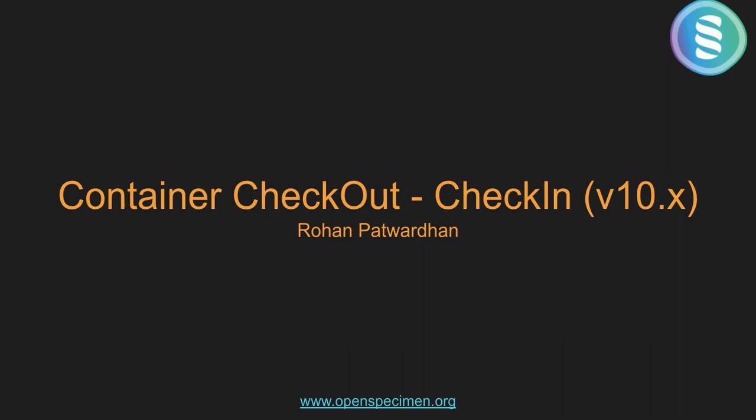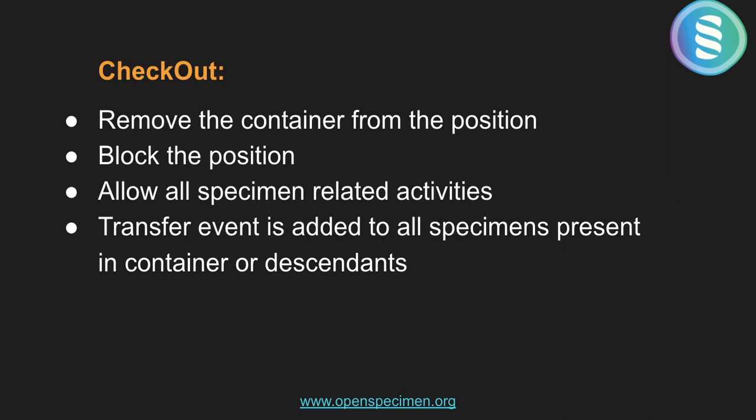Many of the times the freezer facilities store the specimens in boxes or drawers and racks and everything, and send it to researchers on a temporary basis, and researchers return it back to the freezer facility in some time. To record all such activities, these two features are now supported.